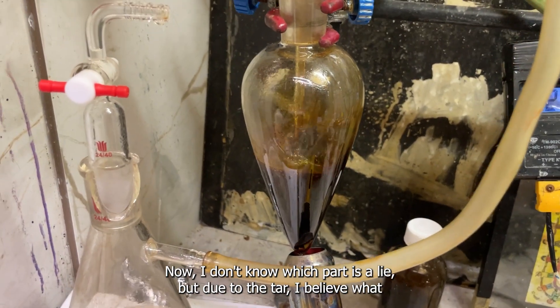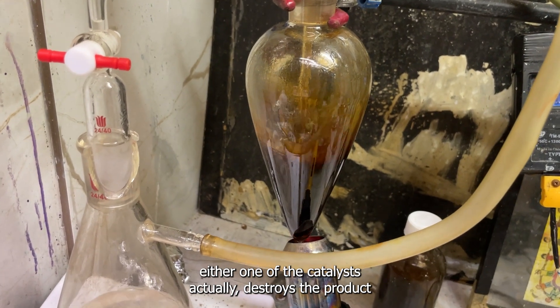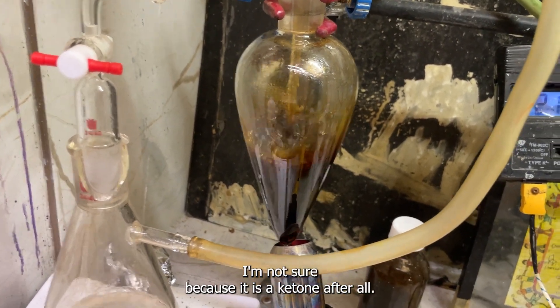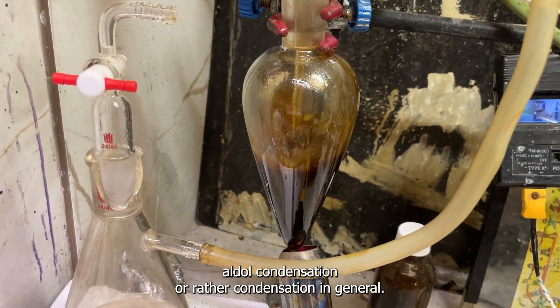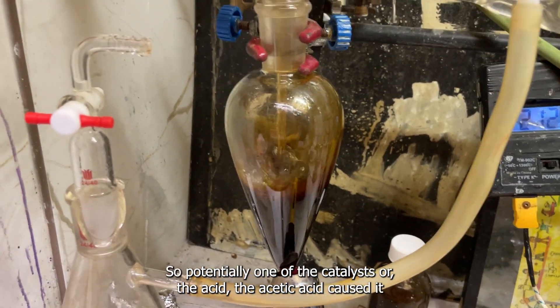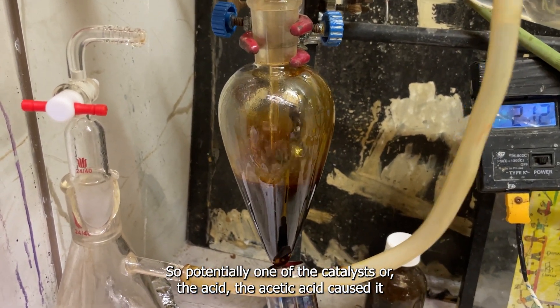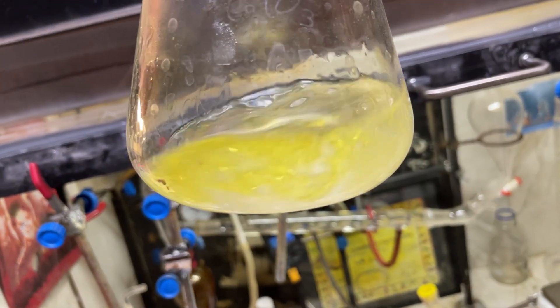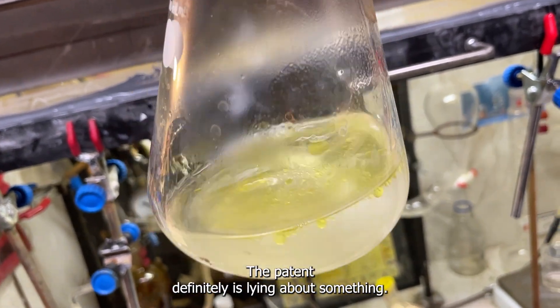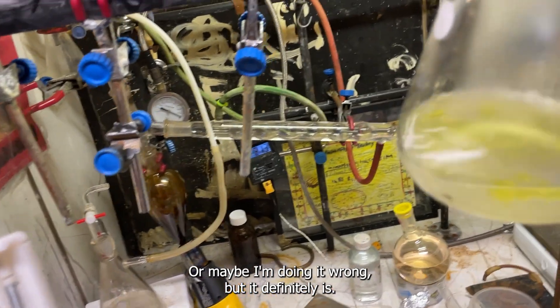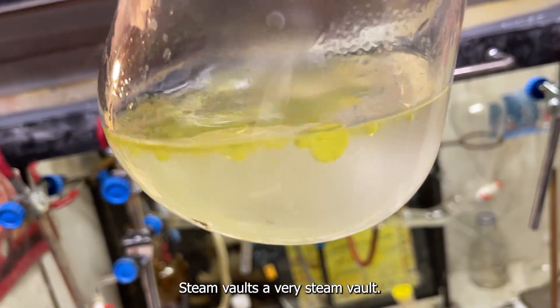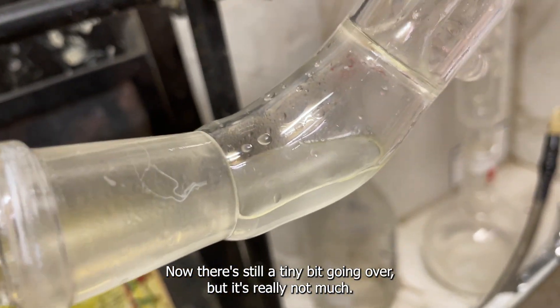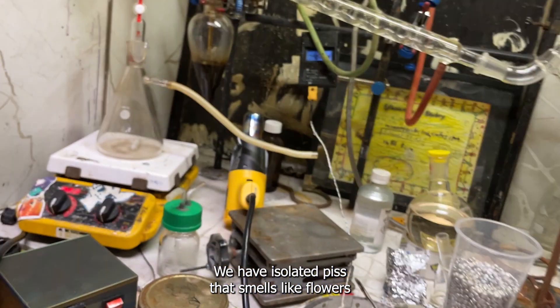This leads me to believe that they likely lied about some part of the reaction, because it should have a lot more yield than that much based on how much cyclohexanone I put in. I don't know which part is a lie, but due to the tar I believe either one of the catalysts actually destroys the product, or maybe the solvent does. I'm not sure, because it is a ketone after all and they're quite sensitive to aldol condensations and condensation in general. Potentially one of the catalysts or the acetic acid caused it, I don't know. Glorious, we have isolated piss that smells like flowers and kind of burnt rubber because tar.